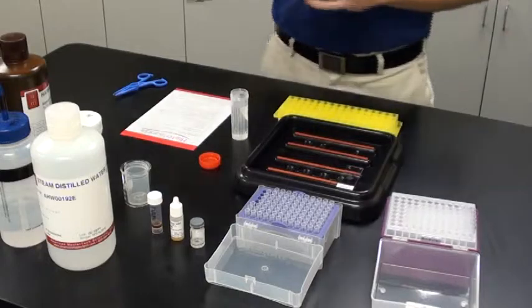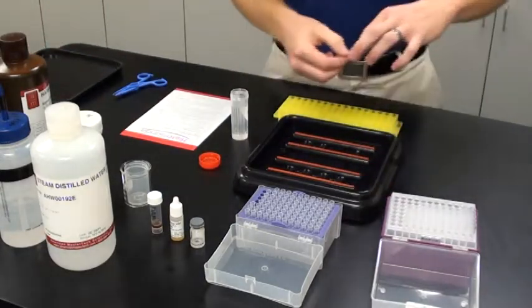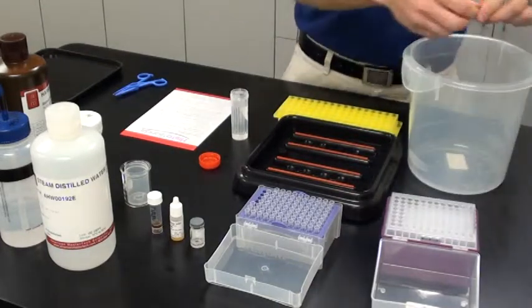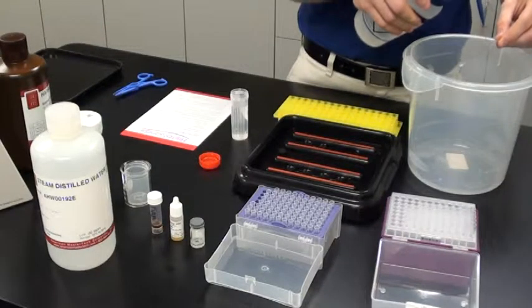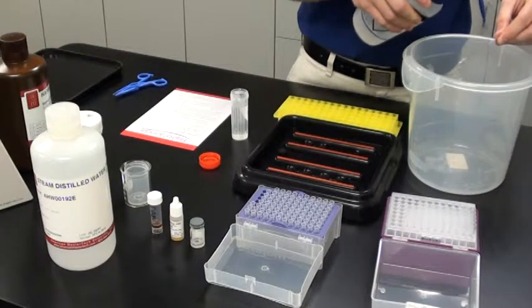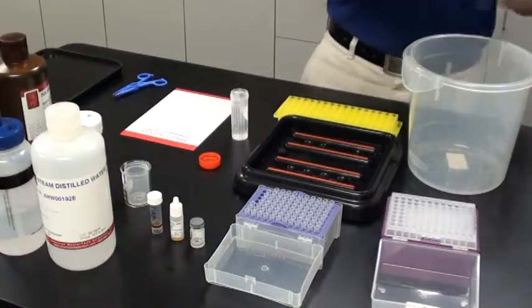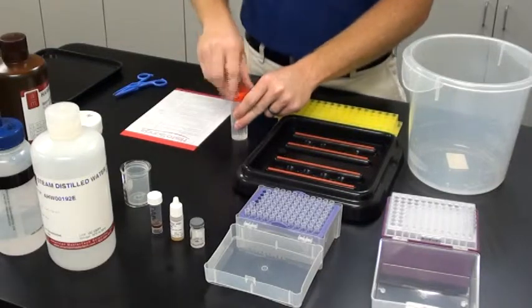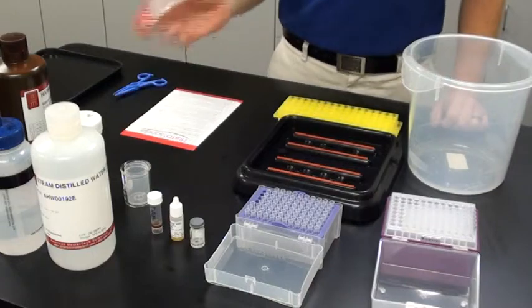After 30 minutes, we're going to remove the slide from the humidity tray and we're going to rinse it off again with PBS 7.4. Once we've done that, we're going to put it back into our slide jar filled with PBS 7.4 and we're going to hand agitate or put it on a rocker for 2 minutes.